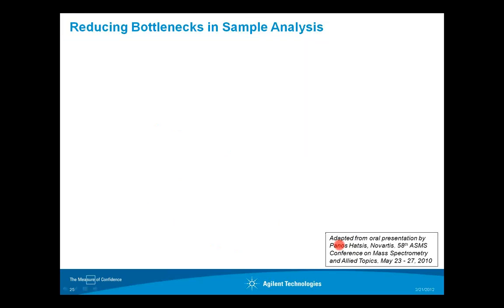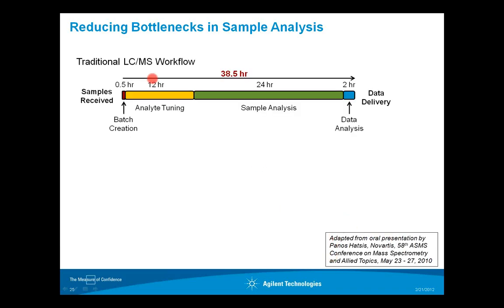Now, I told you that what's really important for RapidFire and in vitro ADME is the ability to process faster or reduce bottlenecks in sample analysis. One of our collaborators presented this at ASMS a year or so ago, and this is a typical workflow in this investigator's laboratory working on in vitro ADME analysis.